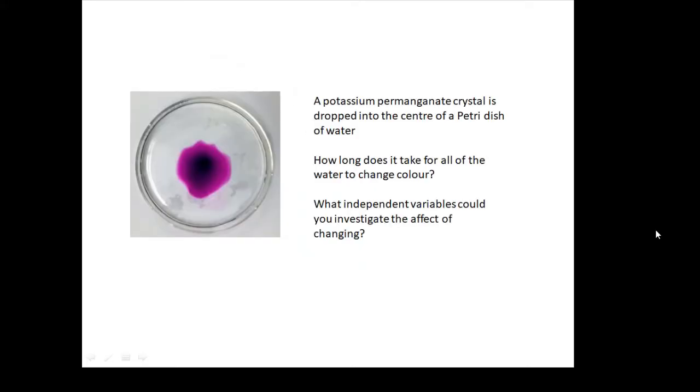The first experiment is very simple. You get a petri dish full of water and drop a little potassium permanganate crystal, this little purple crystal, in the middle. Then you watch what happens as the purple dye spreads and fills the water.